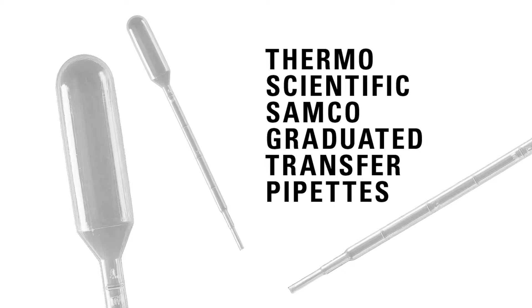Thermo Scientific Samco graduated transfer pipettes are disposable liquid handling devices that are made of clean, flexible, chemical resistant polyethylene material.